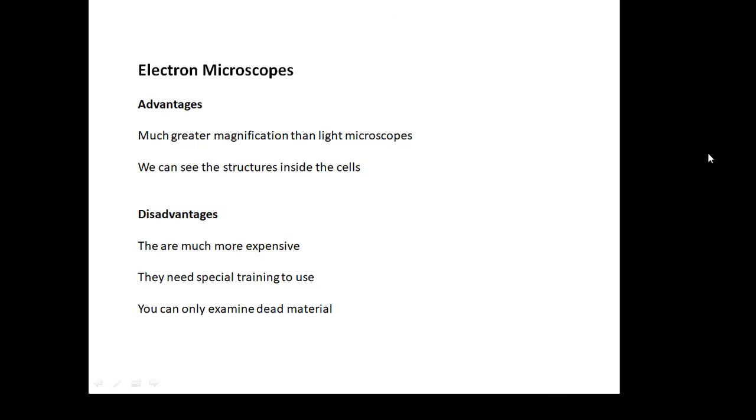The disadvantages, well, they are much more expensive. They're very expensive. You need special training to use it, and you can only examine dead material. Because you're blasting it with very fast moving electrons, you can only look at dead things.